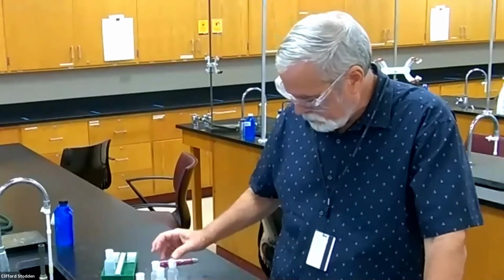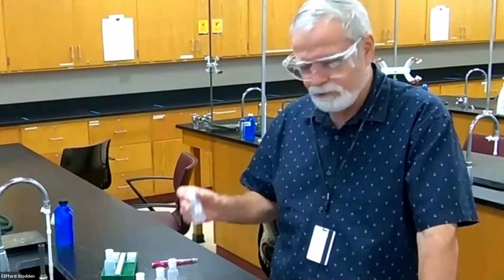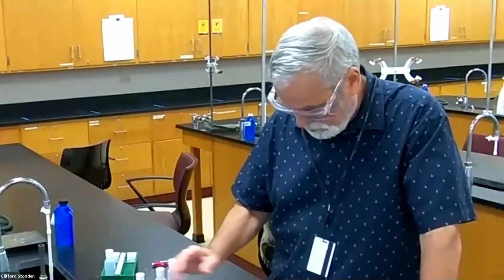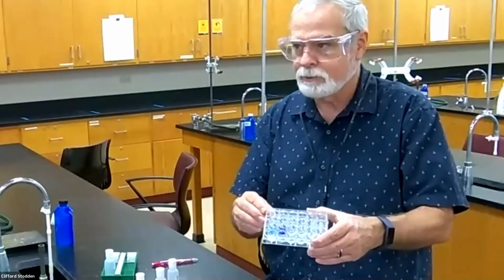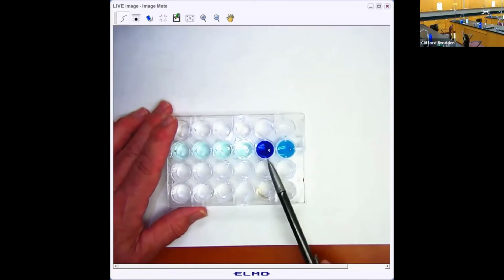And then the last one's the sodium hydroxide. This one would give me some information if something happened, because again, you're assuming you wouldn't know which bottle is the sodium hydroxide before you did this. Now this is interesting. It's slightly changing the color. It's making it a more pronounced blue. That's this one. Let me show you this on the camera. Okay, so these are the last two that I did. Okay, this is with the ammonia.